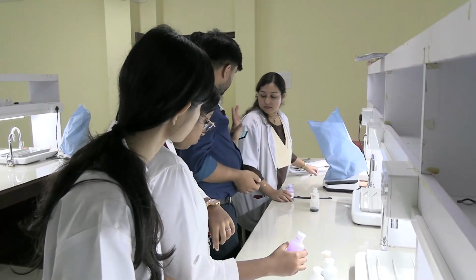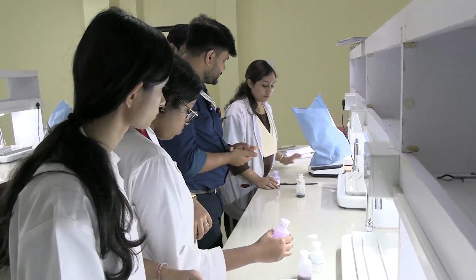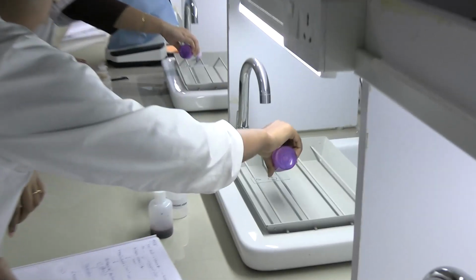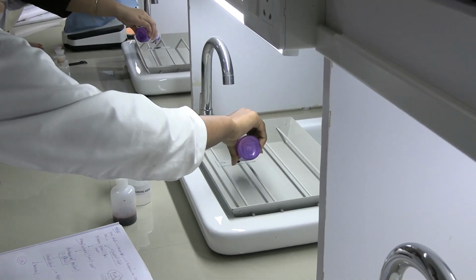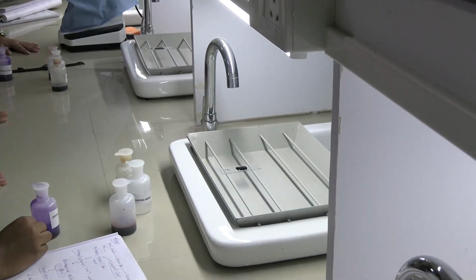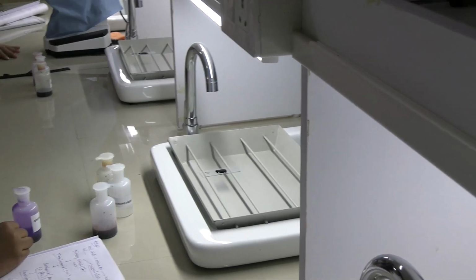Okay, you've got the slide now. So start. That is up to you, okay? Push, squeeze, squeeze, squeeze. Good, I think you are done. You are also done. We're gonna wait for 1 minute, okay?